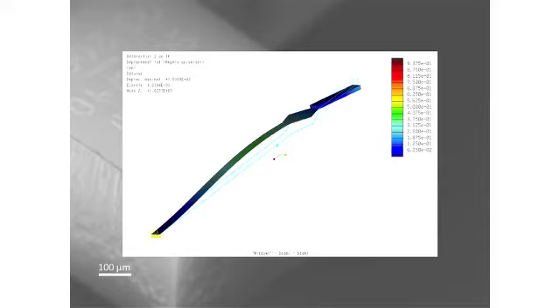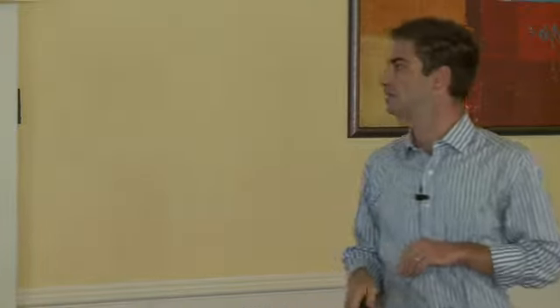Okay, this is a picture of the actual microwire RF source and little magnetic tip, which is made out of iron cobalt. These are some samples that were realized in our lab in Basel. With such microwires and tips, when we bring our cantilever with a sample very, very close, maybe a few hundred nanometers from the top of that tip, we can get very large rotating fields at a few hundred megahertz, and very large spatial field gradients of around 10 to the 6 Tesla per meter. These are really critical parameters for magnetic resonance force microscopy to have a high resolution. And these all have to be achieved in vacuum and at very, very low temperature, so the thermal heating due to this wire has to be minimized.